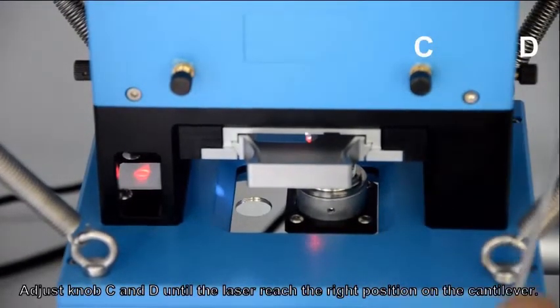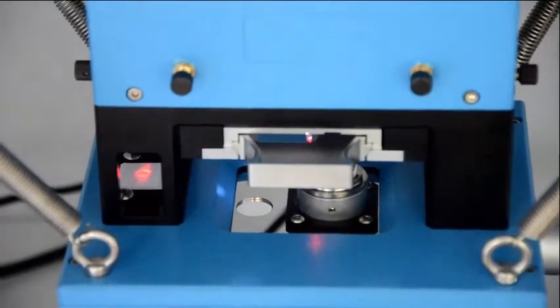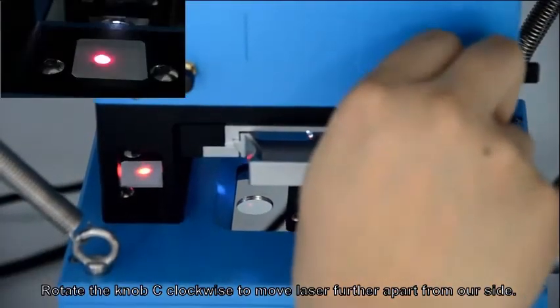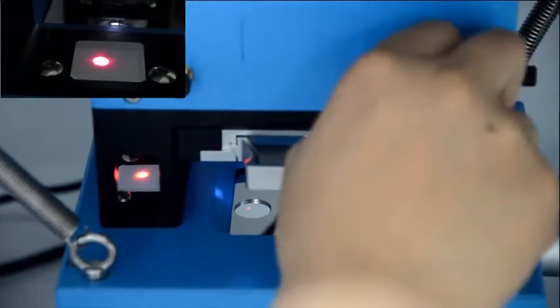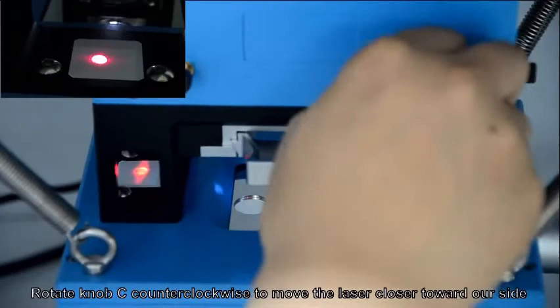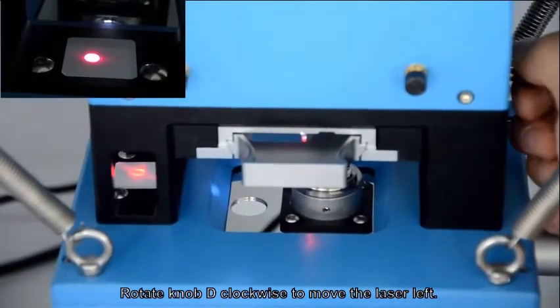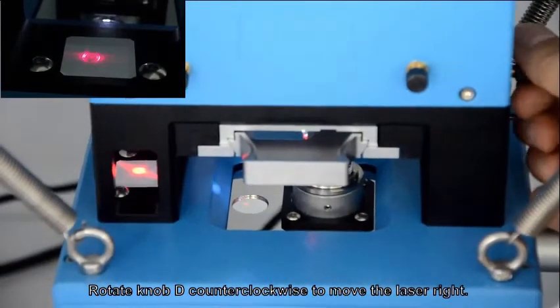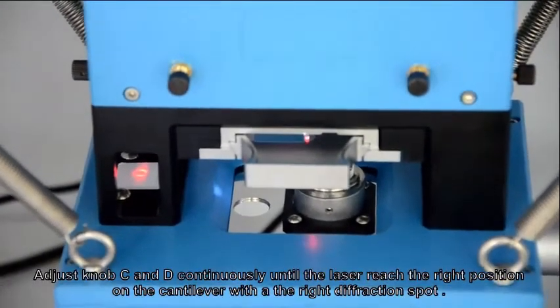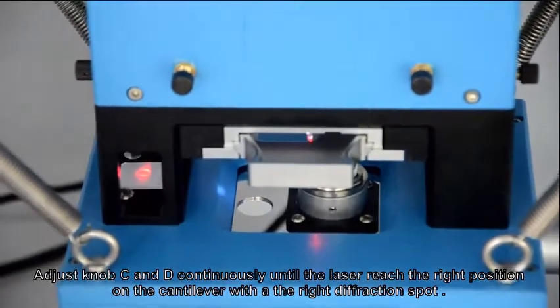We can judge the laser position on the cantilever by observing the shape of the diffraction spot. Adjust knob C and D until the laser reaches the right position on the cantilever. Rotate knob C clockwise to move the laser further apart from our side; rotate knob C counterclockwise to move the laser closer toward our side. Rotate knob D clockwise to move the laser left; rotate knob D counterclockwise to move the laser right. Adjust knobs C and D continuously until the laser reaches the right position on the cantilever with the correct diffraction spot.